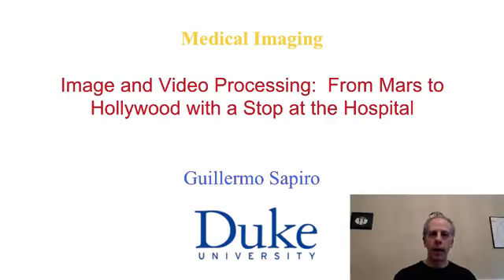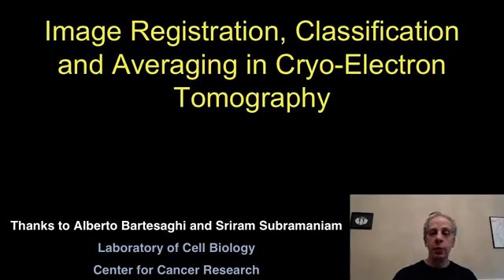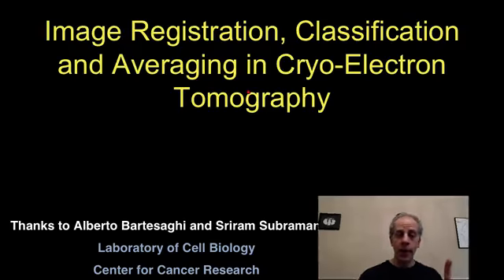Hello and welcome back. In this video, we're going to be talking about image processing in a very particular application in medical imaging, and this is image processing for virus understanding, and in particular, to understand the shape of the HIV virus. This actually brings a lot of challenges, as we're going to see. We're going to have to talk about many topics in image processing, including image acquisition. And let's start with that.